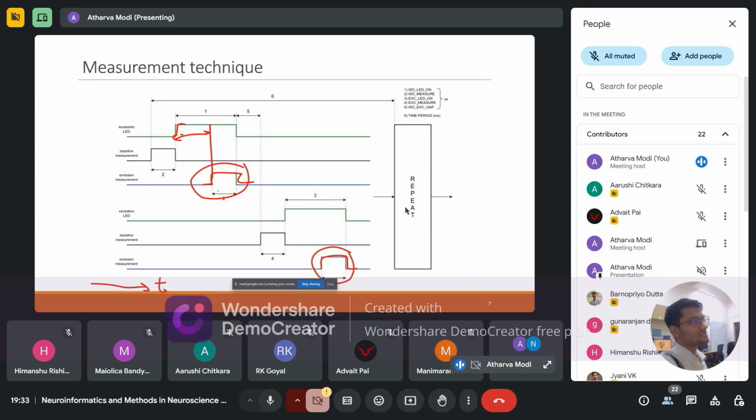measurements. So any change in this value here, if it correlates with the change in this value here, that means that it is not due to whatever analyte you wanted to measure. This is how you get two measurements very near in time, so that you can control for noise or artifacts.